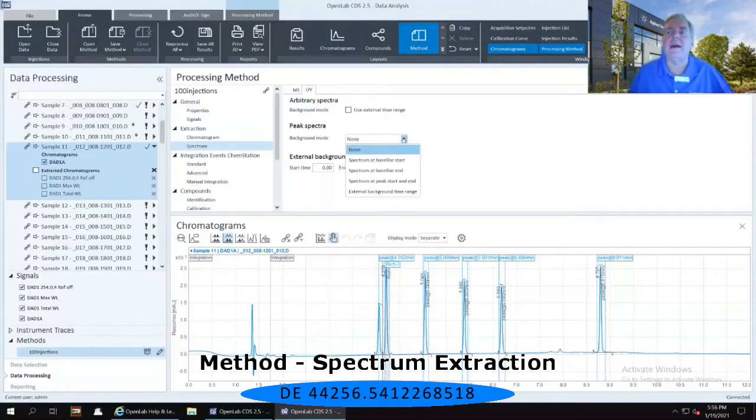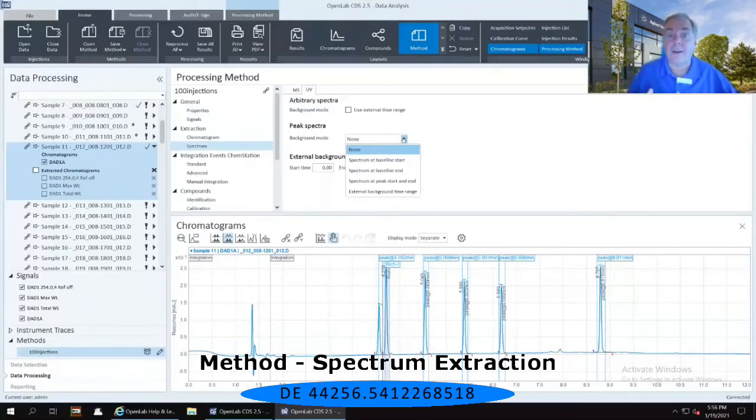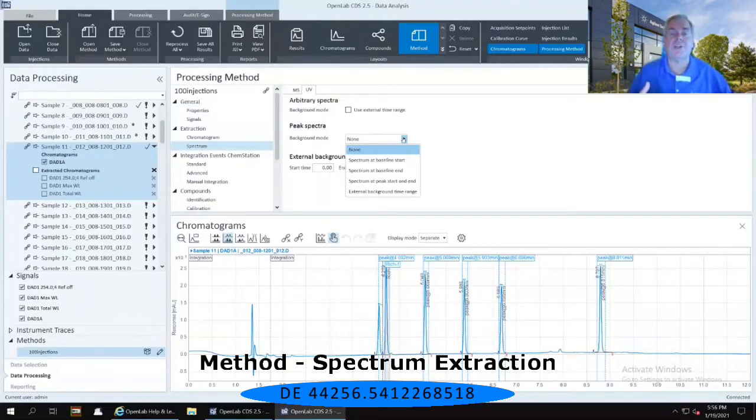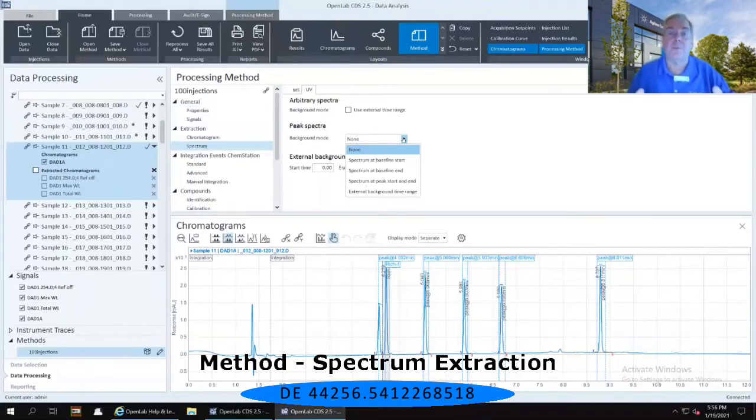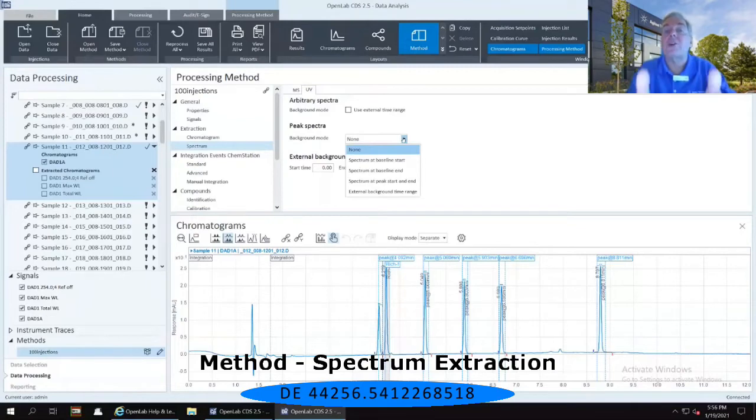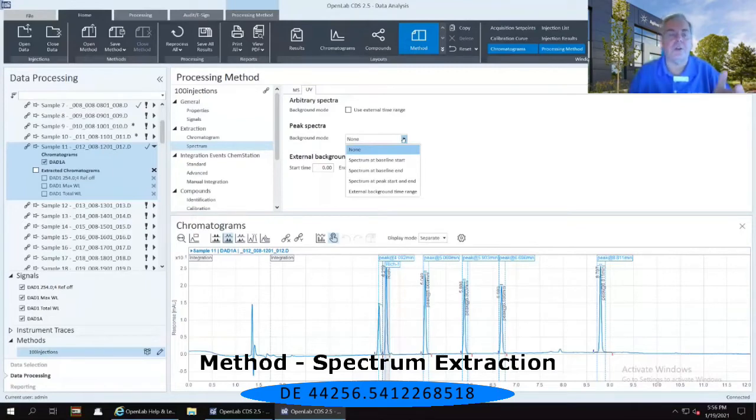And the spectral subtraction works exactly in the same way as you would think the chromatographic blank subtraction occurs. It simply takes spectral information from whatever you have defined here, and there are four different options here.